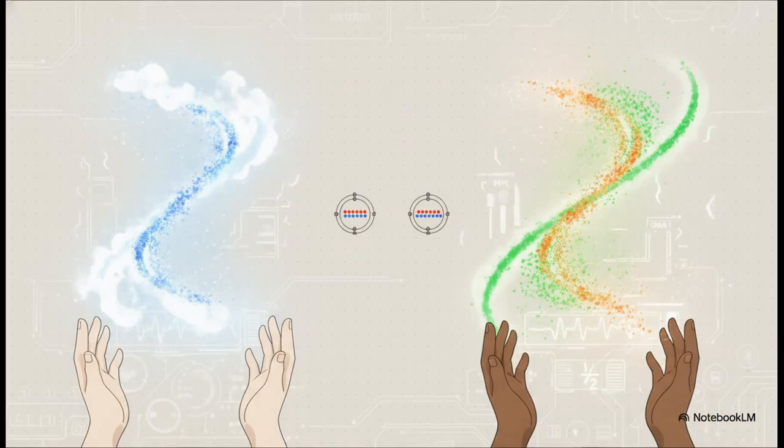So our biggest hurdle right out of the gate comes down to isotopes. Take carbon-12. It's the most common isotope by far, right? It has an even number of protons and neutrons. But because of that perfectly even pairing, its spin quantum number is exactly 0. That means it is completely 100% NMR inactive. It's basically a ghost to our machines. So that leaves us relying entirely on its cousin, carbon-13, which actually has an odd number of neutrons, giving it a workable nuclear spin of 1/2.